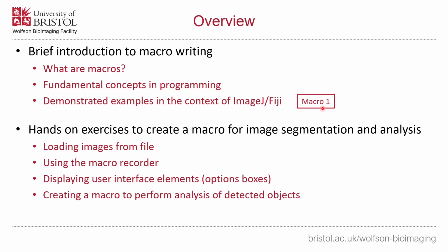And then finally ending up at creating a single working macro that allows you to load images, apply settings to a GUI, detect objects, and then run a bespoke analysis on them.